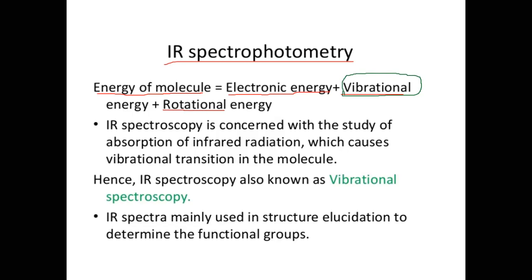And so what happens is in the IR infrared region, molecules vibrate at certain frequencies. Based on the type of bonds you have in your molecules, they give different vibrational frequencies. And from that, you can determine the types of functional groups in your compound based on how those bonds vibrate.